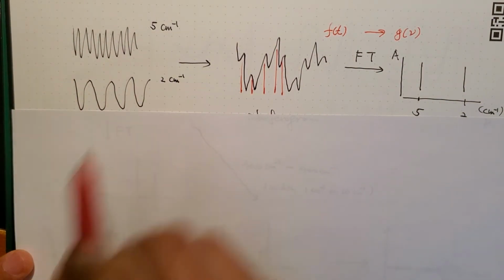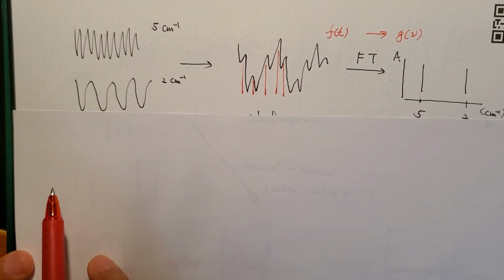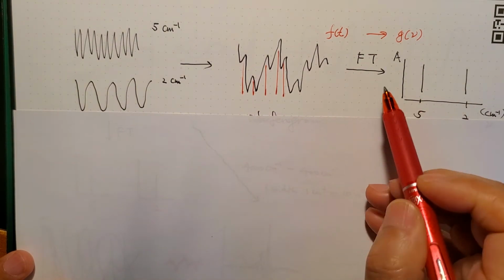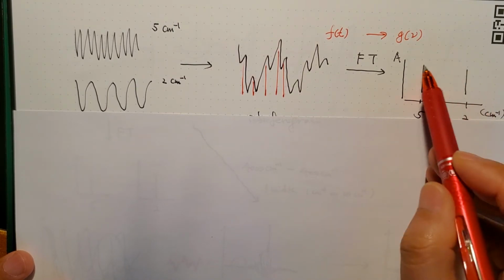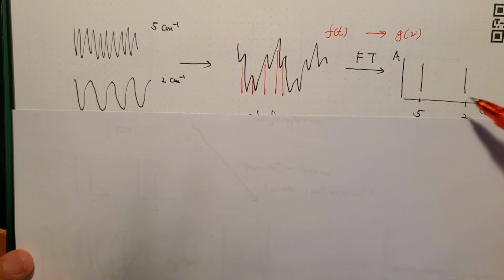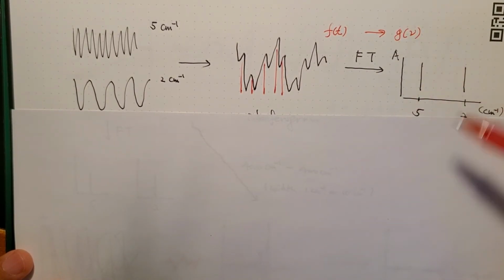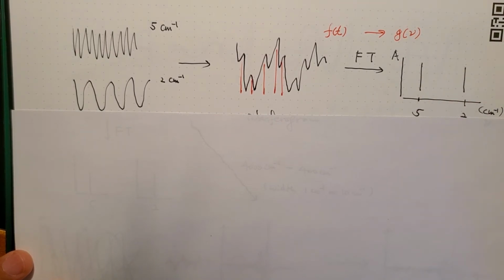Remember, that's the one coming out of the sample, so they may not have the same intensity. There could be variations of it, but this Fourier transformation is able to catch that and show different intensity at the different frequency. Now we are ready to correlate each frequency with the materialistic model, the molecular structure.